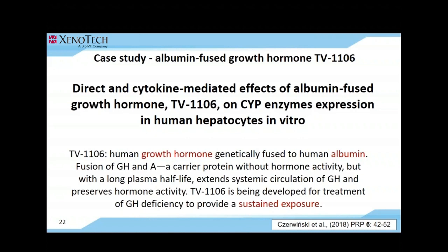TV1106 is being developed for treatment of growth hormone deficiency to provide a sustained exposure. The aim of the study was to evaluate whether genetically fusing growth hormone to albumin changes drugs' effects on drug metabolizing enzymes. Such changes could affect DDI potential of the modified peptide. I need to add that growth hormone is known to stimulate cytokine release and to have effects on drug metabolizing enzymes. Focus of the study was on cytokine-mediated suppression of drug metabolism by unmodified and albumin-fused peptide.